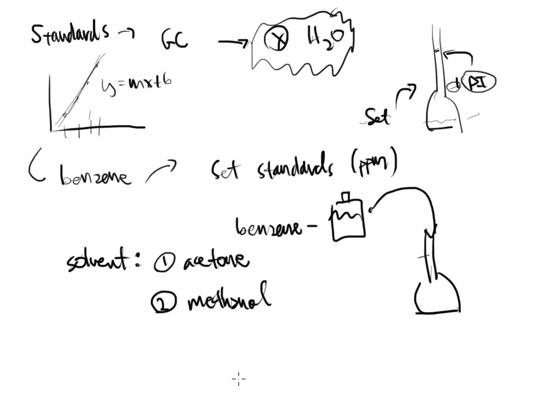If you take a look at the standards, especially if you've watched the video already of this small amber looking vial that has an etching on it, and then it points up to a tip, and the guy snapped and broke it and then transferred that standard into another container where he then used it. All of those types of standards are going to be dissolved in acetone or methanol.